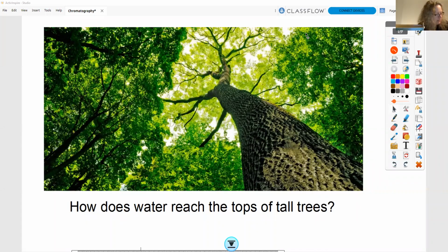Good morning, chemistry. Our next chapter is on chromatography. Chromatography is a method of separating the components of a mixture that might be difficult to separate from the other methods that you have learnt. So the components of a mixture, like the mixture of coloured inks that make up this purple texture. And you've probably seen this done before.